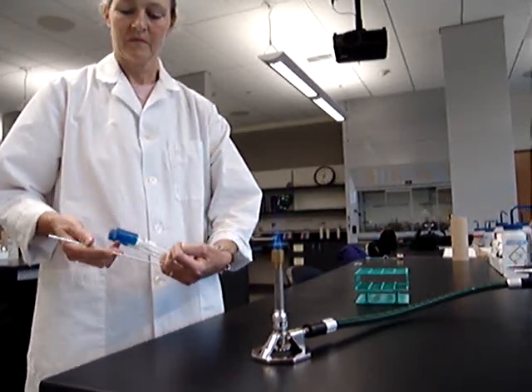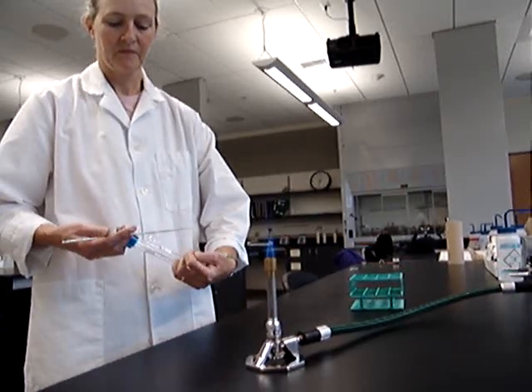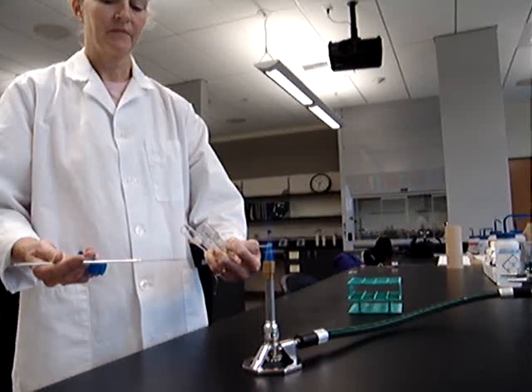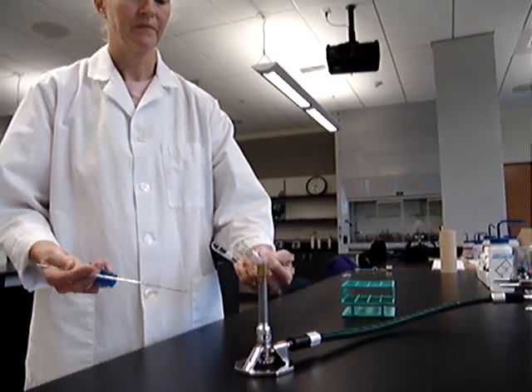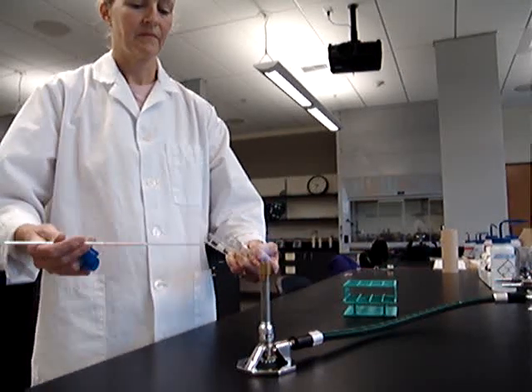Okay, now she's going to carefully take the lids off of her tubes. She uses her fingers along the ridge, the aspects of the tops, to make sure she does not contaminate her tubes. Go ahead and flame your tubes — flaming the mouth of the tubes sterilizes them for the transfer.